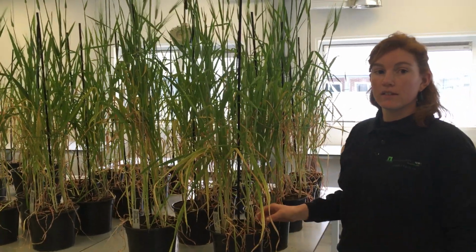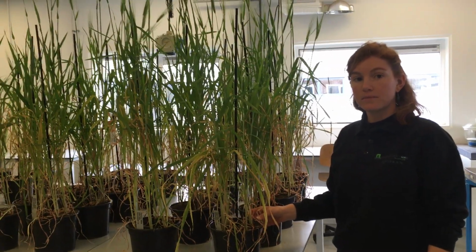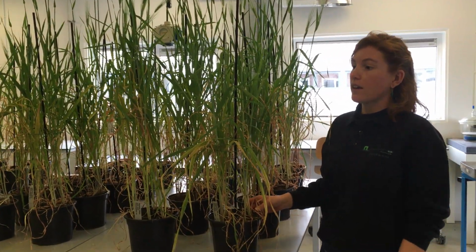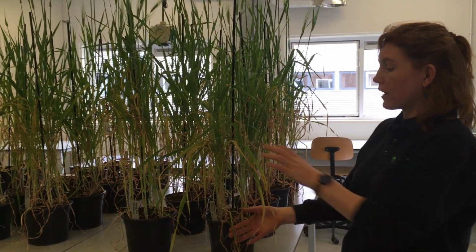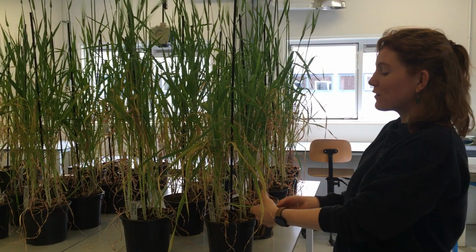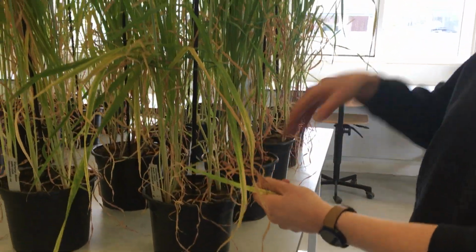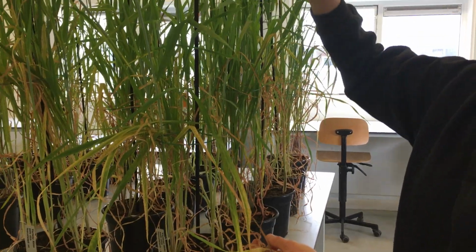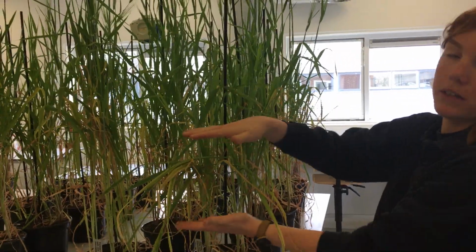And if we do the scoring of the infected plants, which leaf should we look at? The middle leaves. Yeah, sorry, the middle leaves. The lower leaves are essentially dead already, and the top leaves have not yet been inoculated. So you really want to look at the middle section.